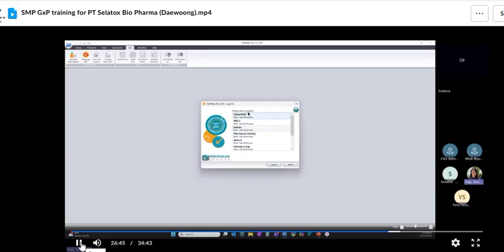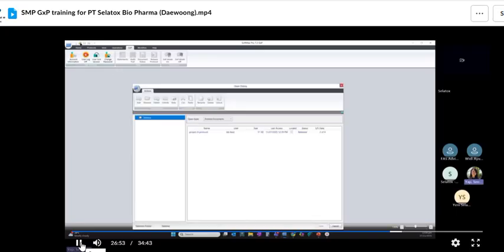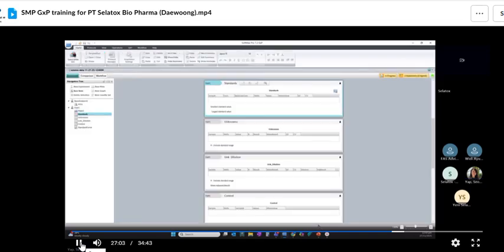Okay, so I will log in this folder. Okay, all right, and then you go here, this folder here. You will see protocol documents. You will see this protocol file. Okay, you just open. All right. Do you notice I didn't need to save anything? You see the file save according to what the scientist said. No need to do anything.